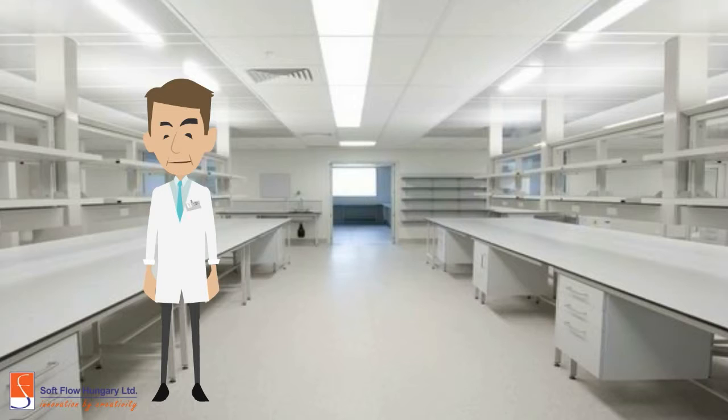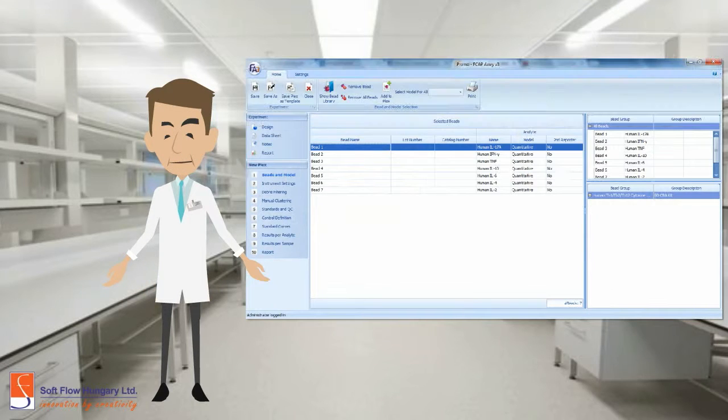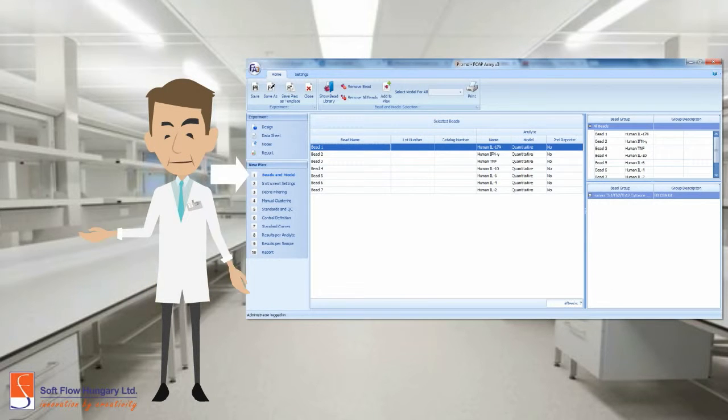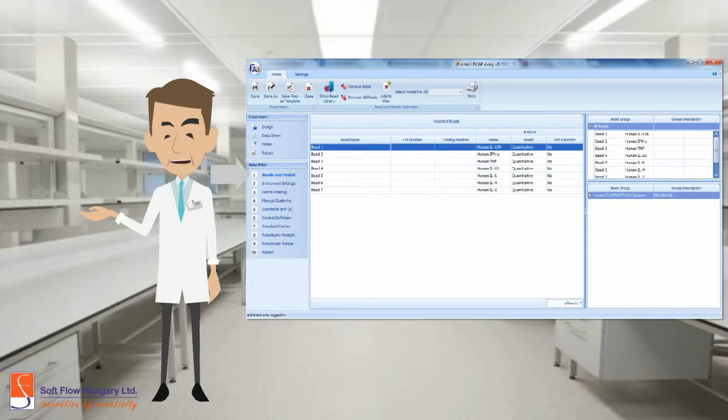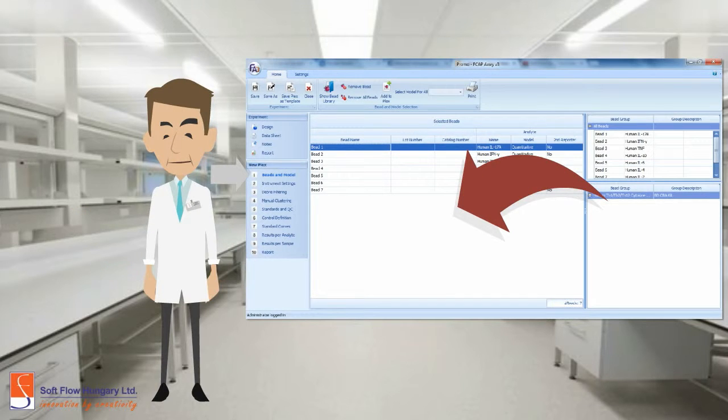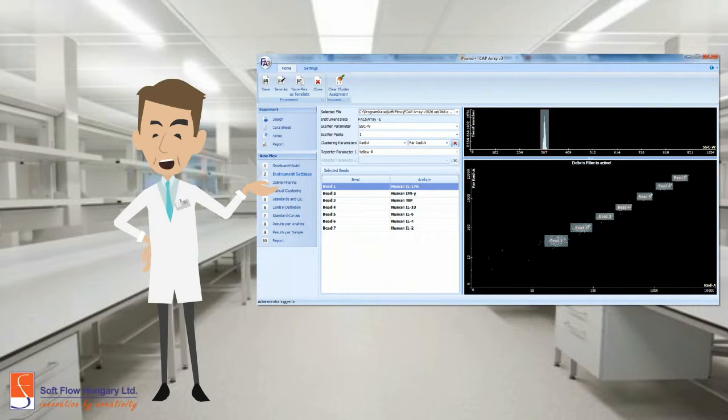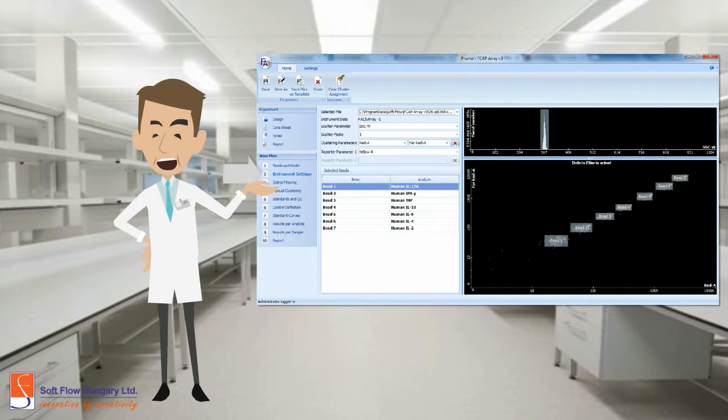Now, you are in the New Plex block. Firstly, you can define the beads you want to use. Drag and drop them. Then, you can change the instrument's settings. In this area, you can define the clusters based on beads number. It's a user-friendly interface.